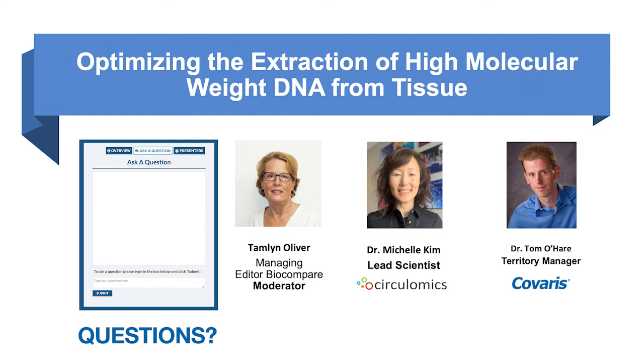Okay, next question is a protocol question. Is there a special protocol for isolating high molecular weight DNA from mucosal tissue? We are using the cryoPREP in our department, but when adding buffer to the pulverized mucosal tissue, we see a lot of clumping. Let's see. I guess what buffer are they adding to the pulverized mucosal tissue? That clumping could be a lot of extracellular matrix, things that would have to be cleared away.